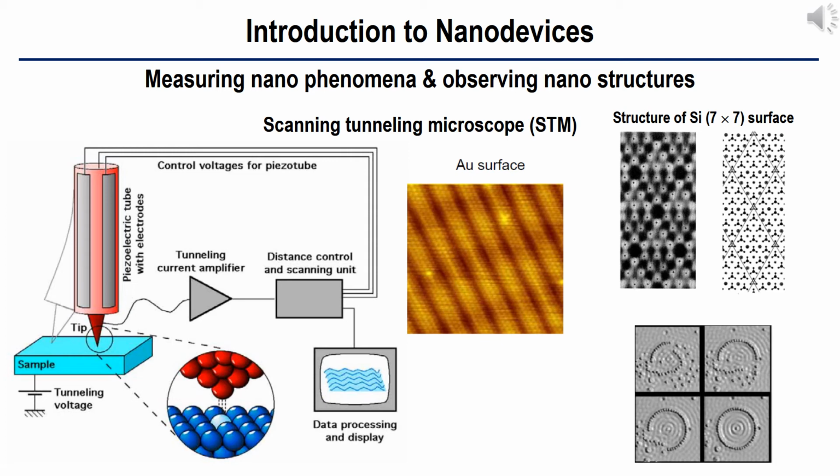As shown in the left figure, when the tip of the STM's needle is brought very close to a conductive surface that has a voltage bias, by measuring the current of electrons that are tunneling between the needle and the surface, the distance between the needle and the surface can be measured. By using piezoelectric rods that change in size when voltage is applied over them, the height of the tip can be adjusted to keep the tunneling current constant.